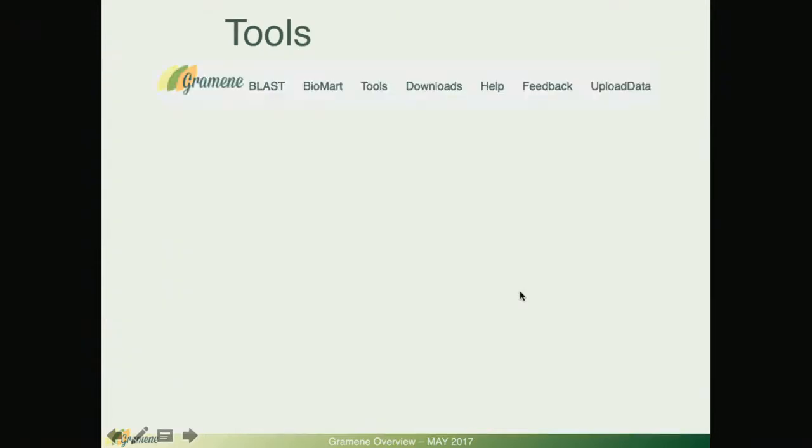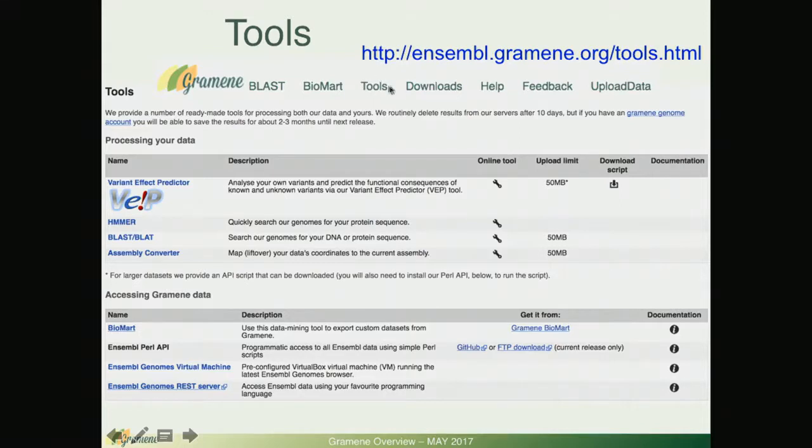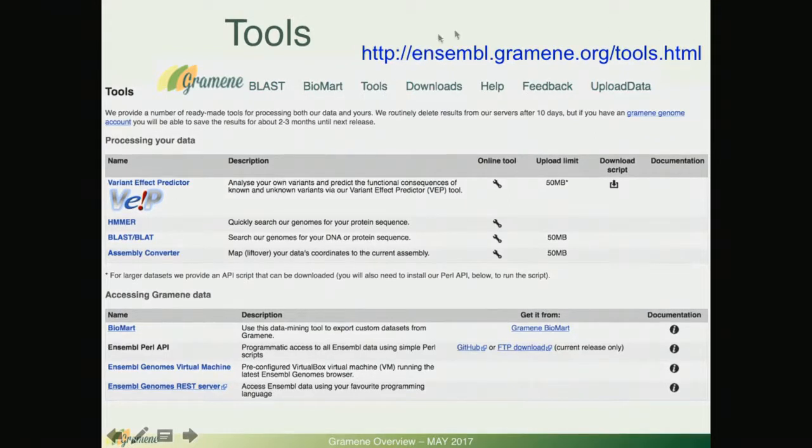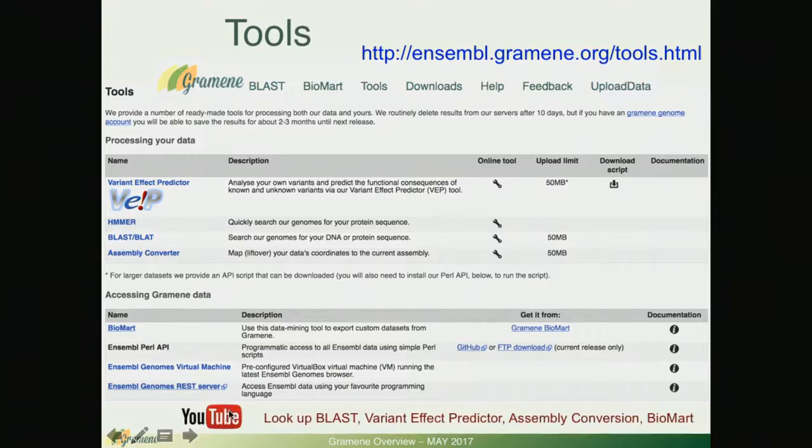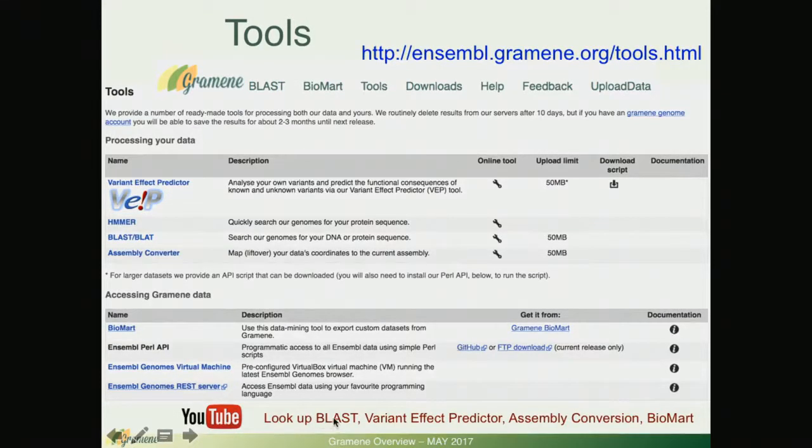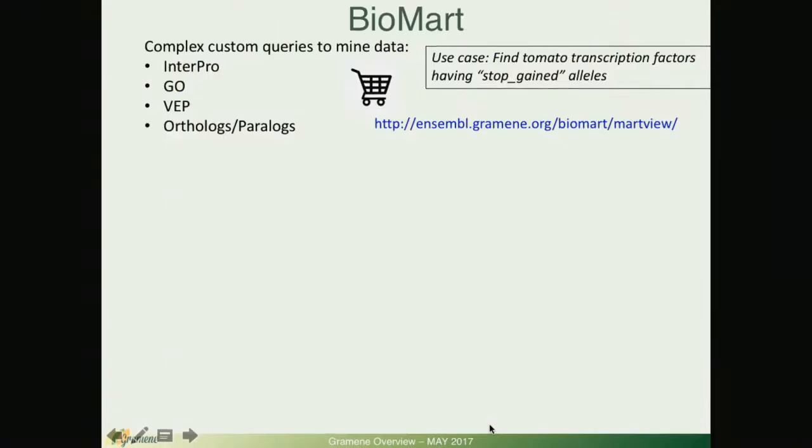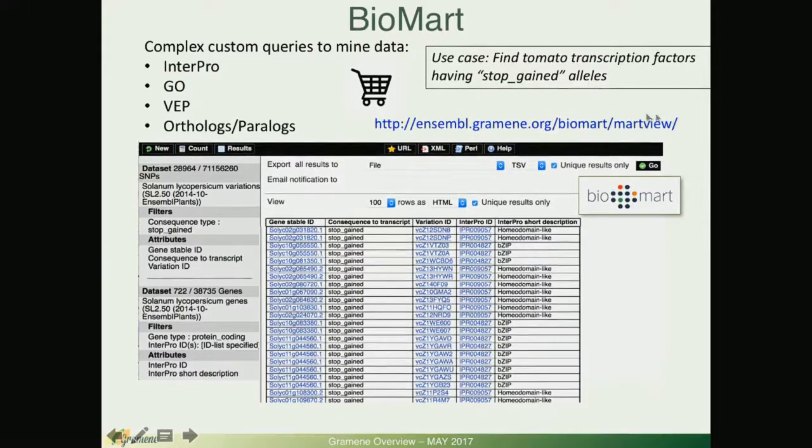You can explore the frequencies a little and population frequencies for a particular variant and so on. Analysis tools, they are accessible from these tools link on the top of every Ensemble browser page and this takes you to this URL. Here on the left are listed common tools and again we have video tutorials for each one of these tools.